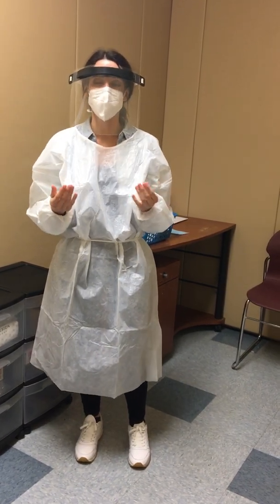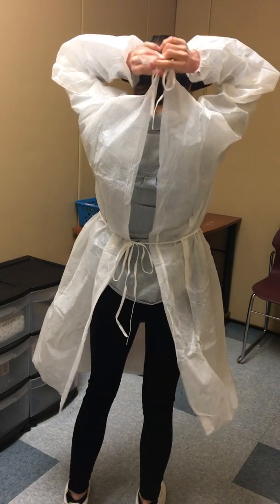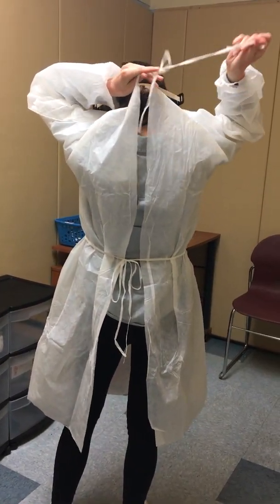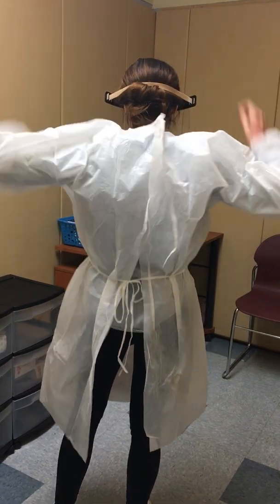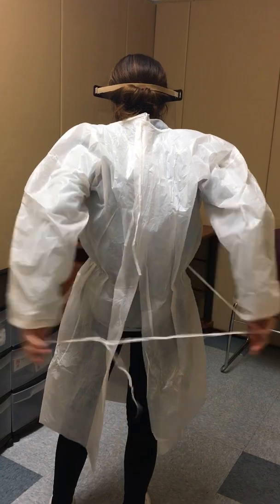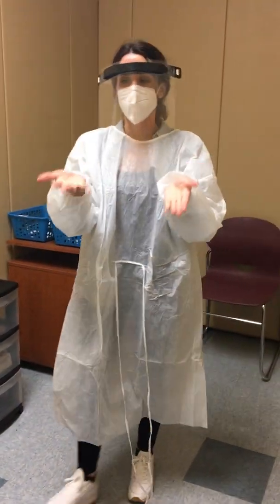And the way that I would do this, because I'm going to reuse this gown, I would untie my ties as I normally would, being careful to not touch other areas of the gown. And then once I untied it, I would actually put on another pair of clean gloves.